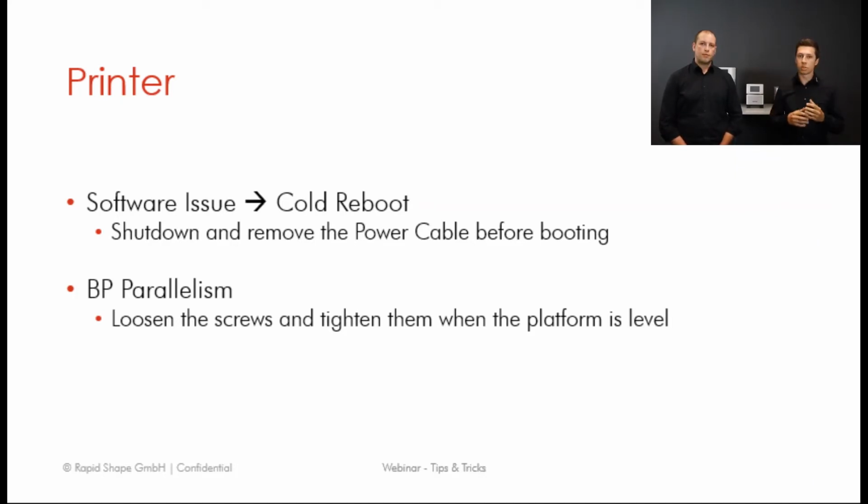Why we want to do a cold reboot is to get rid of all the residual power which is maybe in some parts of the printer. So a cold reboot means shut down the printer via the software, switch off the main switch on the back, and then remove the power plug. Now you can wait for one minute, or you can just get a coffee, for example, and come back and then connect the plug and switch on the printer again. In this way we have a proper cold reboot and can see if the printer is then working fine again. The same thing sometimes happens also to your PC. I think you all know that sometimes a proper restart is just repairing stuff.